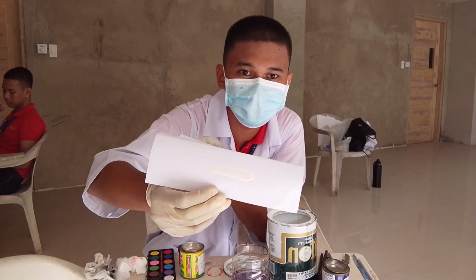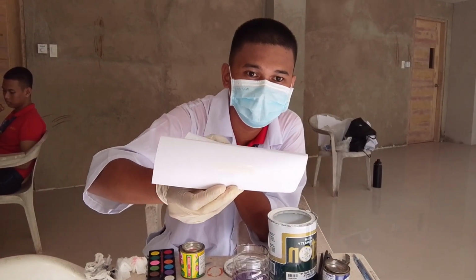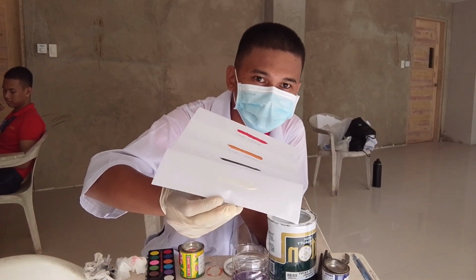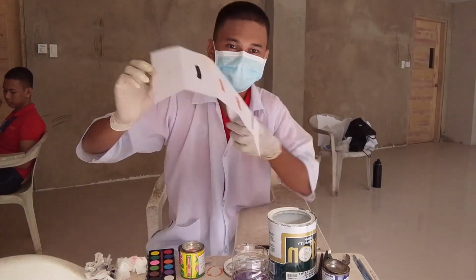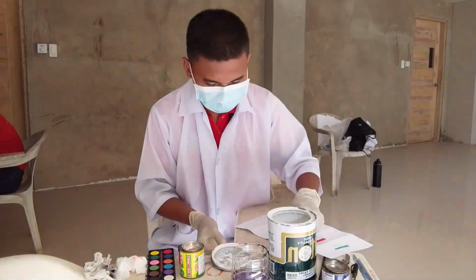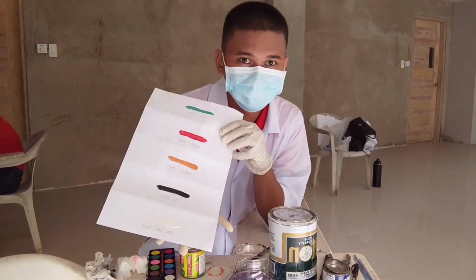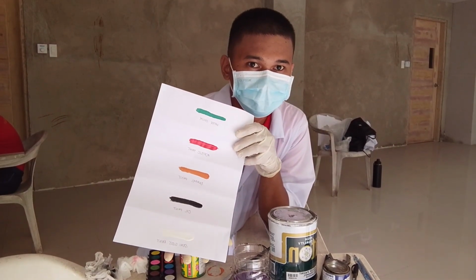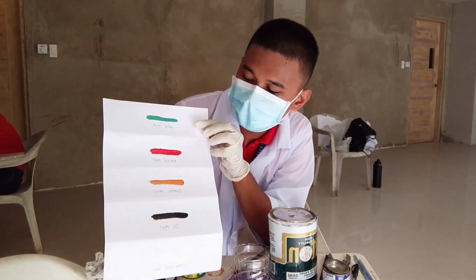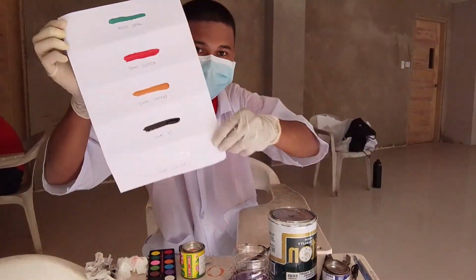For the color, I chose white. For the shade, it is a light shade, and the paint type is semi-gloss paint. Now I will put a label. I am done labeling the semi-gloss paint. I am done comparing and examining the different types of paint. These are the watercolor, the acrylic paint, the enamel paint, oil paint, and the semi-gloss paint.